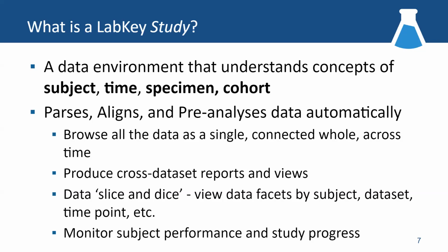The second dimension, the second concept that's built into the study module, is time. Your data can be encoded either as dates, calendar dates, or as some kind of number. But you need to provide the study module some way to capture time, because that's ultimately what you're going to be doing here, is you're going to be tracking your subjects over some time period.